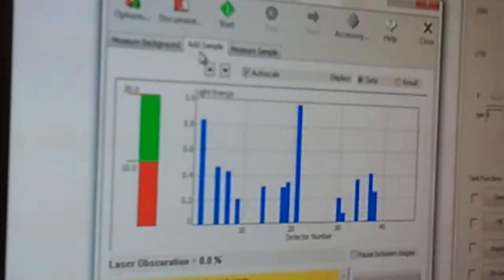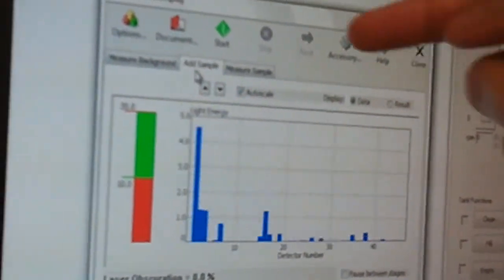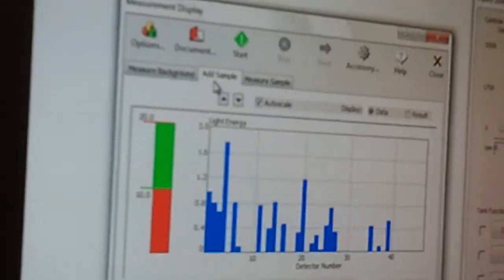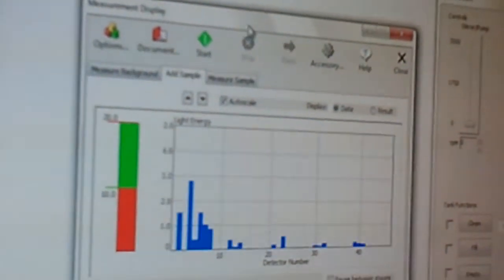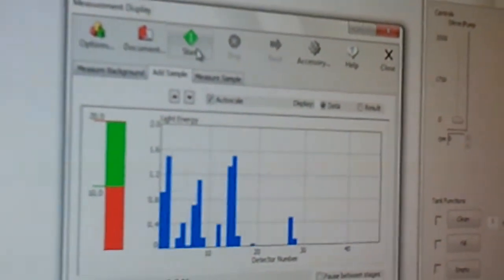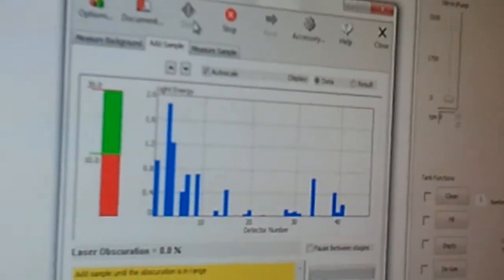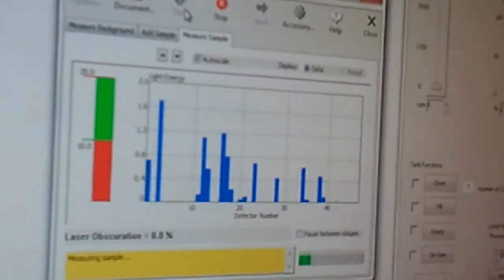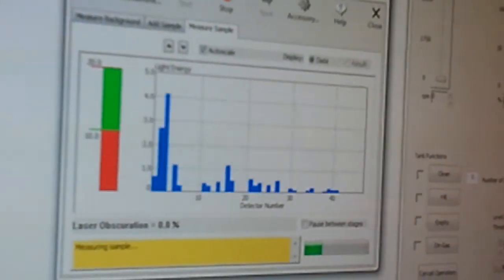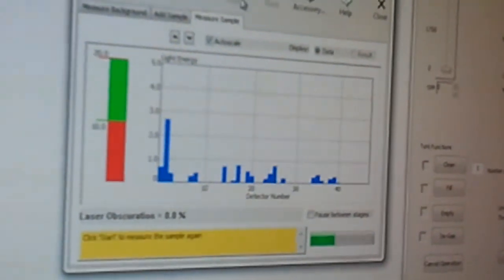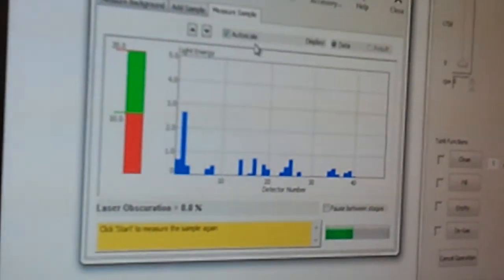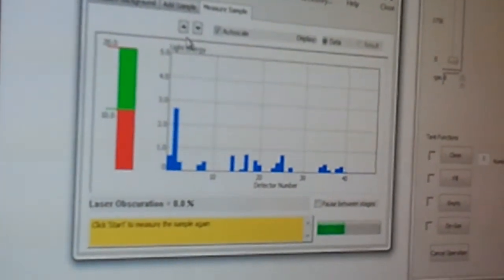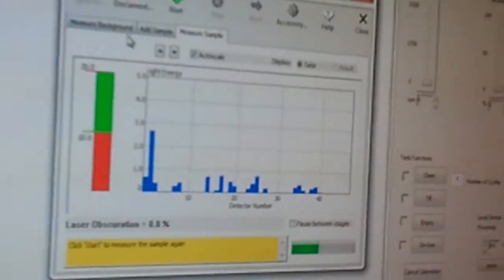So now you press start. Let's do it, so you press start. And then, oh no, hold on - it thinks it's a sample, so let's go back.